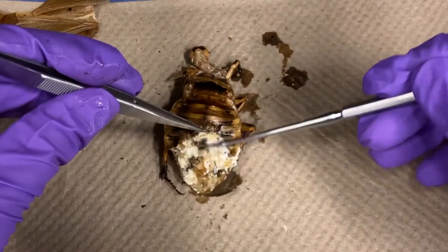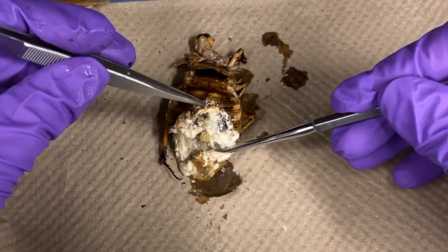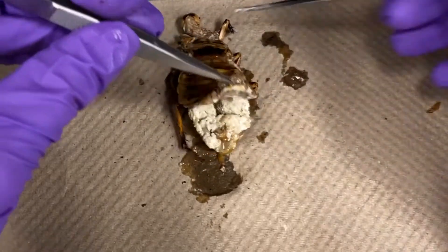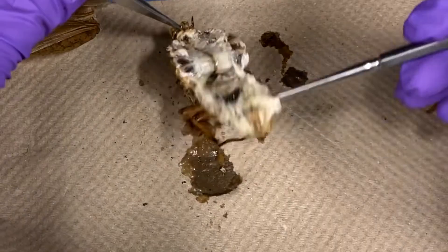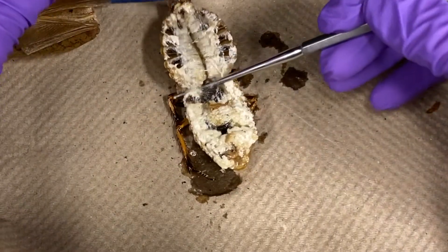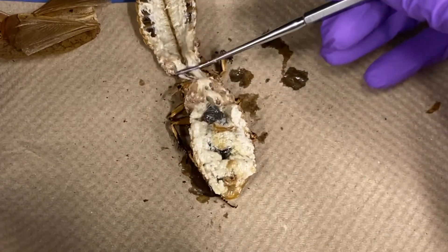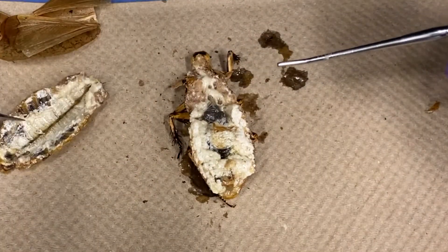Using forceps, hold the epiproct and carefully lift from the posterior end forward, removing the dorsal portion, or tergum, while leaving the anus and hindgut.